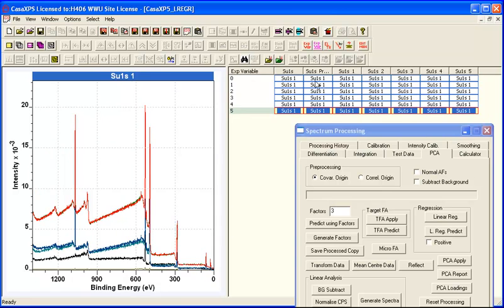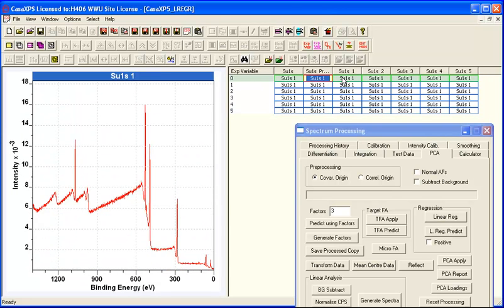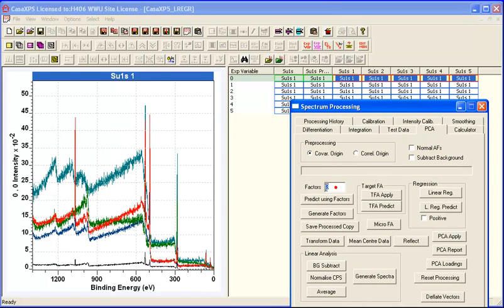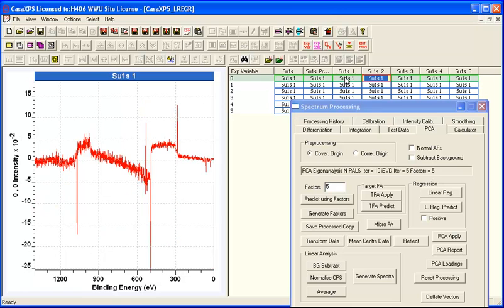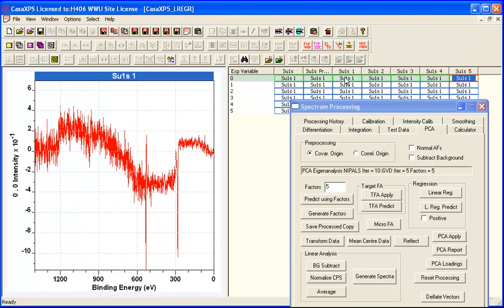So if we can find one of these that contains all of the basis functions, and that makes sense, it's the first one. If I overlay these and I perform a little calculation based on these 5, well, that's the first abstract factor, second, third, fourth, fifth.